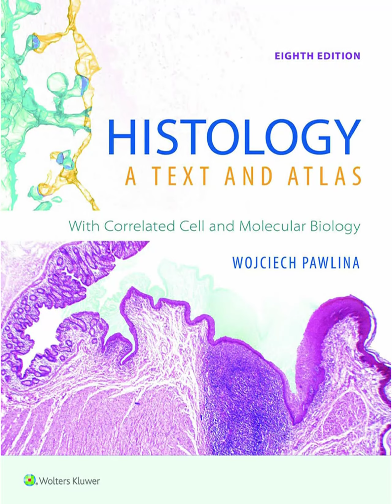And this frozen section technique has a really critical clinical correlation. Oh, how so? Well, frozen sections are often a surgeon's best friend during an operation. Really? During surgery? Absolutely. Imagine a surgeon removing a tumor. They need to know immediately if they got all of it, or if the edges are clear. They'll send a tiny tissue sample, maybe from the margin, straight to the pathology lab. While the patient is still on the table.